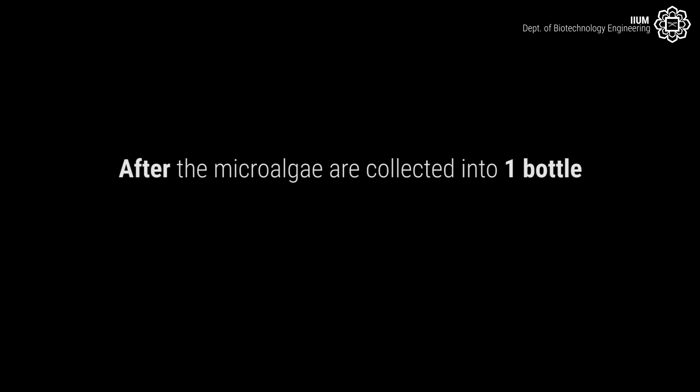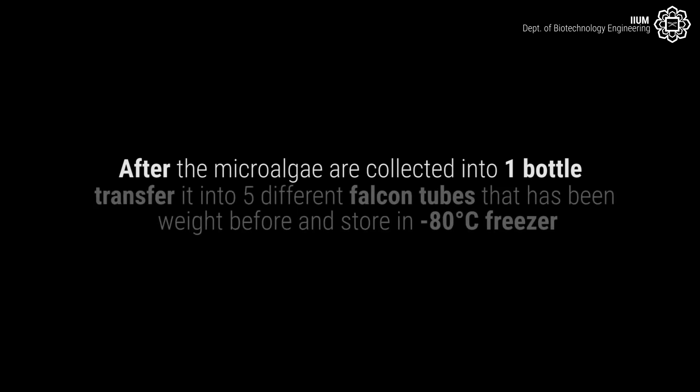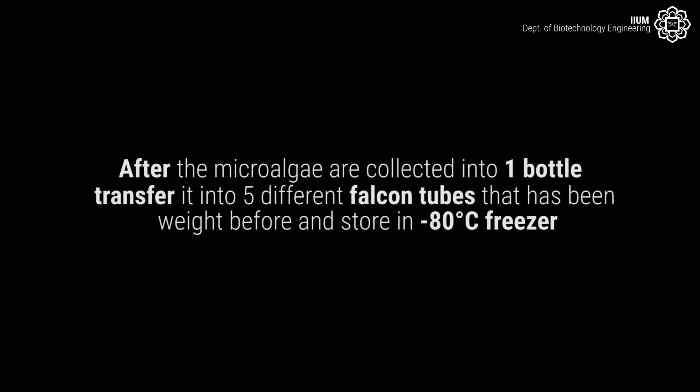After the microalgae are collected into one bottle, transfer it into the 5 different falcon tubes that have been weighed before and store in a minus 80 degrees Celsius freezer.